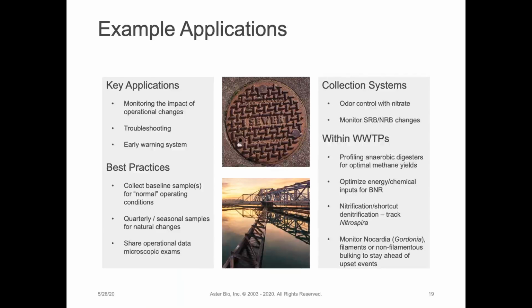Example applications include monitoring changes in the system when you're changing operational conditions. Troubleshooting challenges such as loss of nitrification, and also trying to identify chronic toxicity events, which we'll discuss further in a minute.